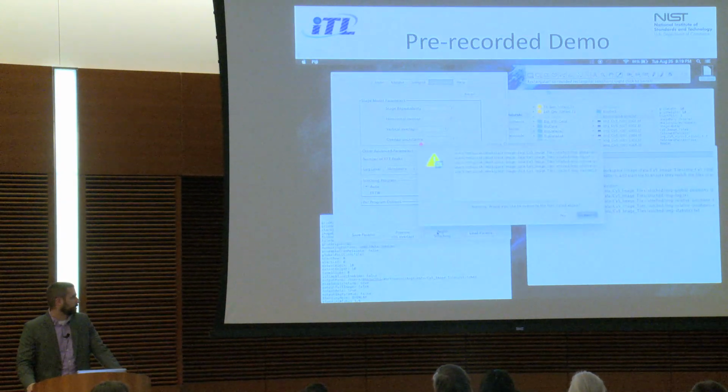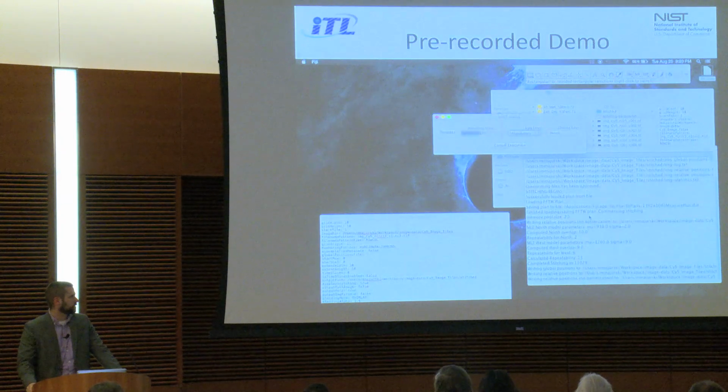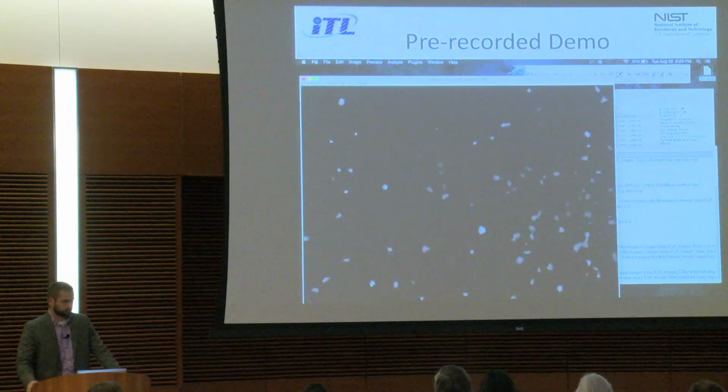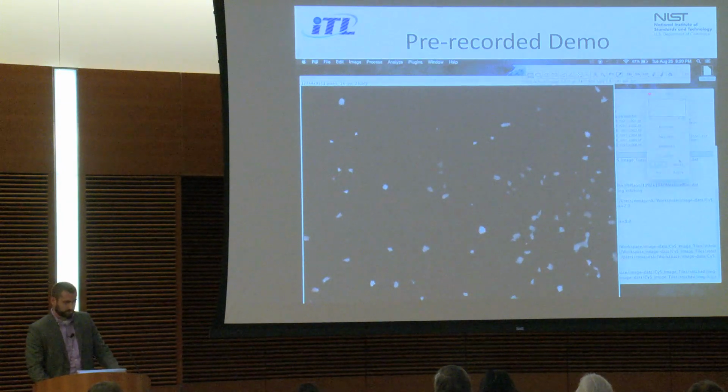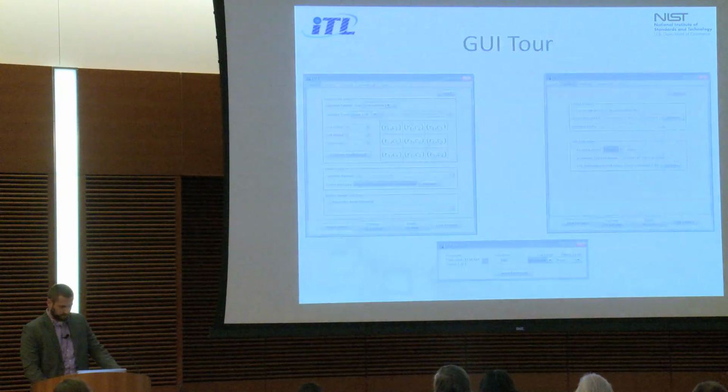Now MIST found a few files it was going to overwrite, so it queried for confirmation before overwriting them. You click Yes, and the stitching will launch. And this is 100 images being reassembled into a single composite. And it's blending them, building the real image in Fiji, and it'll display it in a second. Okay? So like I said, it took longer to set up the grid parameters than to actually stitch the image. This is my backup in case the demo didn't work.